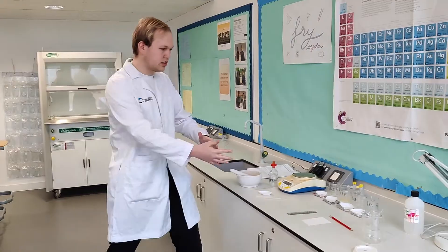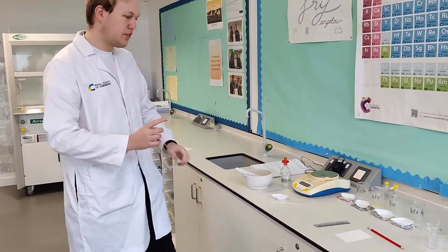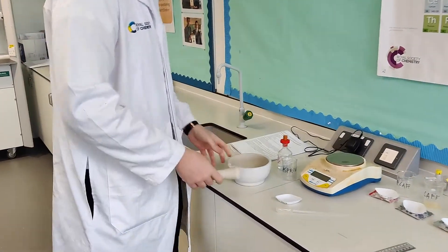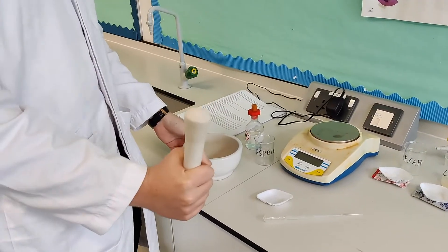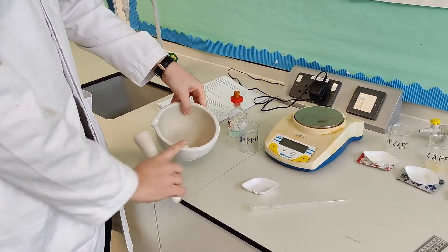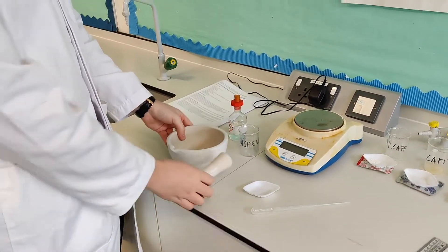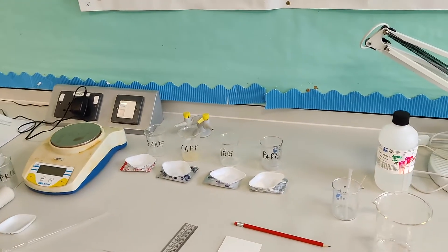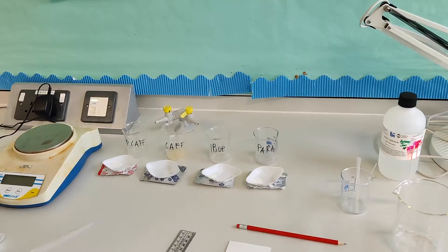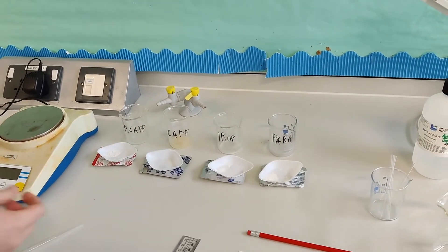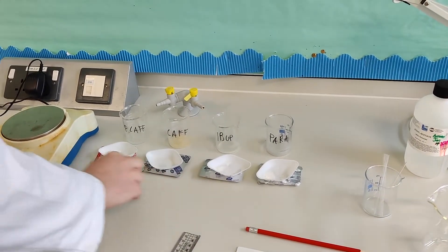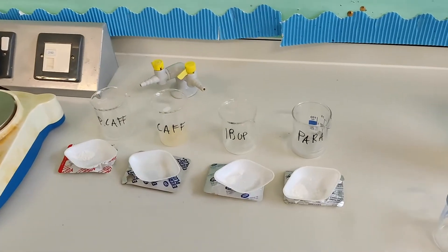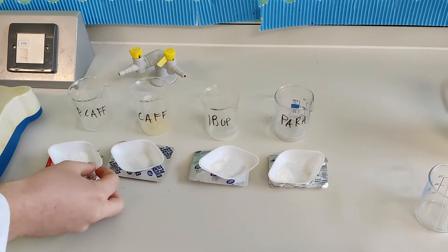So the first thing we need to do, we've got lots of different medicines here, and the first thing we need to do is crush the medicines using the pestle and mortar. This is the pestle, and this is the mortar. And what do we do once we've crushed our samples? So we'll be decanting the ground fine mixture into a weighing boat, as you can see here. I've done a few already, and we get a nice fine powder.